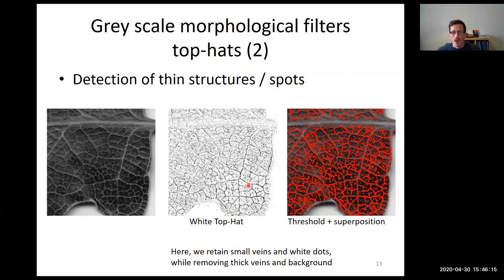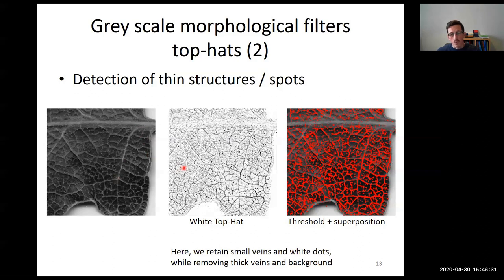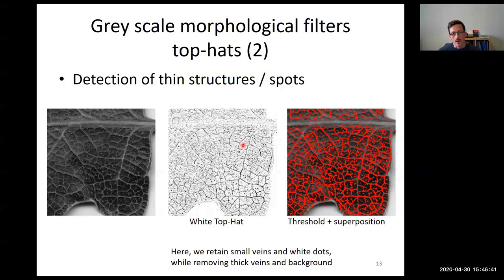An example of white top hat application: on a leaf image, to enhance the network of veins, we apply a white top hat with a structuring element slightly larger than the vein size. The result enhances the vein network effectively.